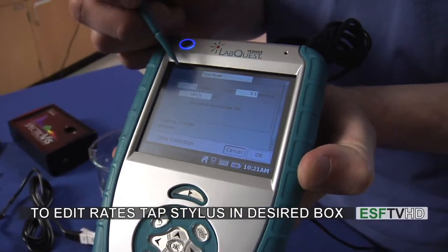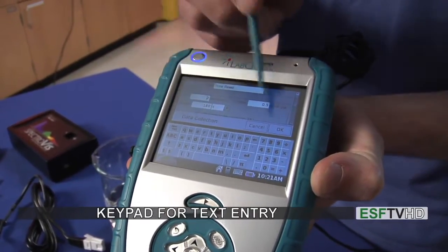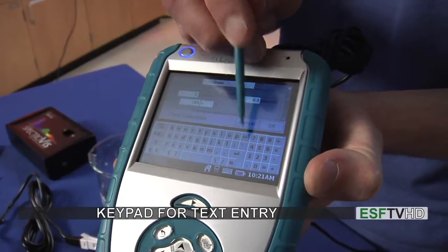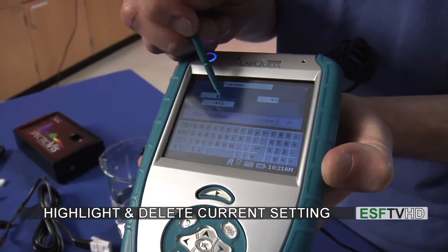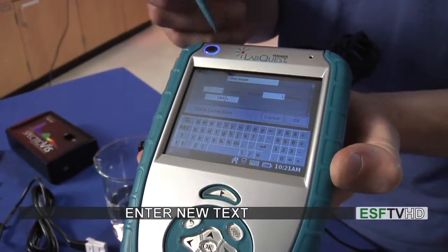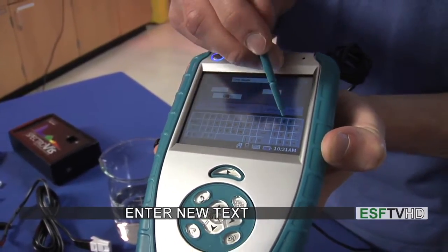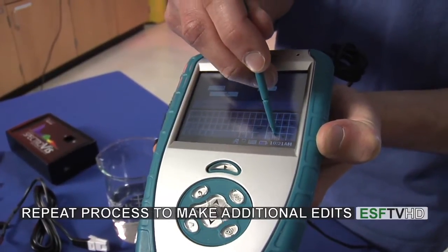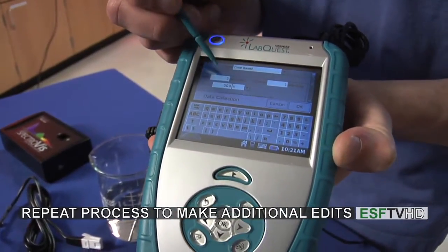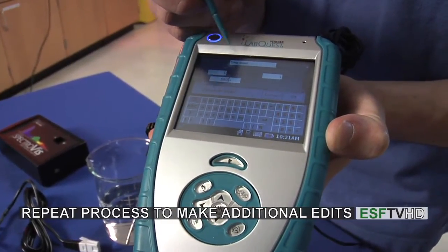I'm going to make some changes to that. If I tap in the box I can bring up a little text box — I'm going to delete the two by highlighting it, clicking delete, and then hit one. I also want to change my sampling time from 180 seconds to 500 seconds. So we now have one sample per second at 500 seconds, and that's going to be time based.